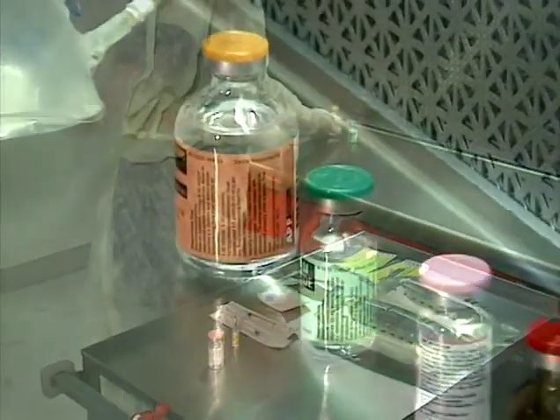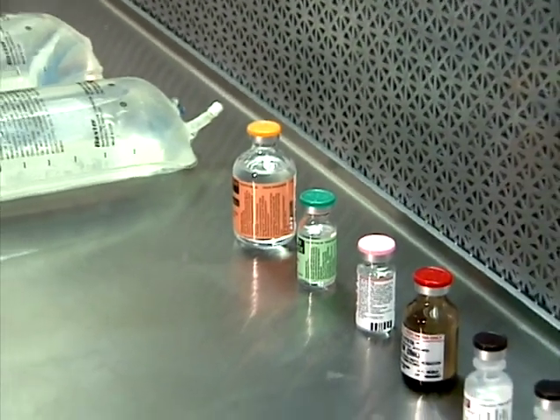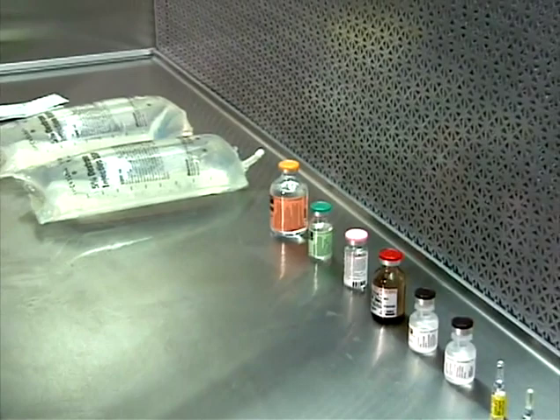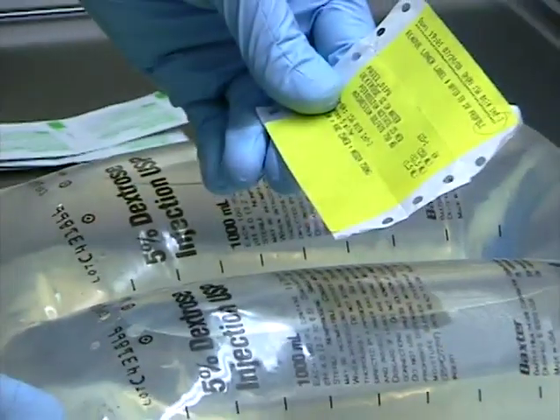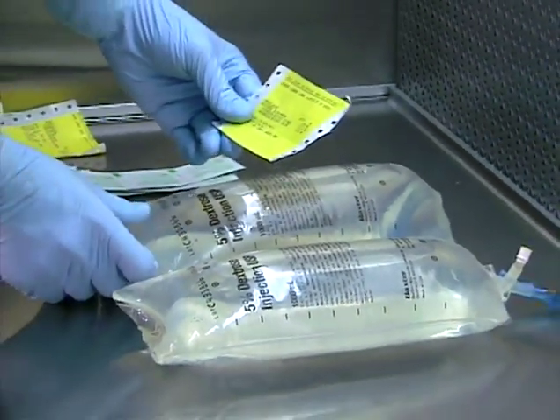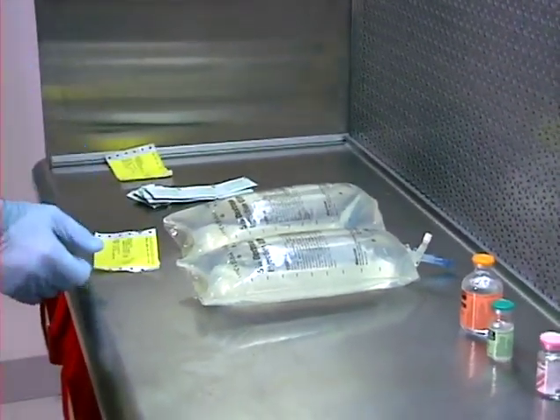Arrange all working materials at one side of the work zone in a manner that facilitates first air to each critical site. In a horizontal LFCB, working materials should be arranged single file, parallel to, and near the HEPA filter. The final containers may be hung vertically from the IV pole or laid on the work surface in a manner which maintains first air to the additive ports.